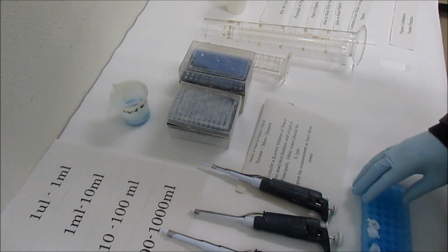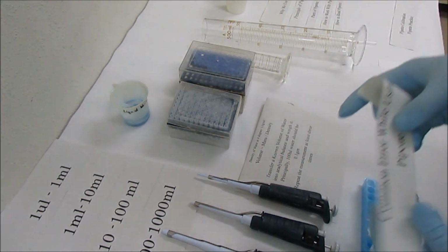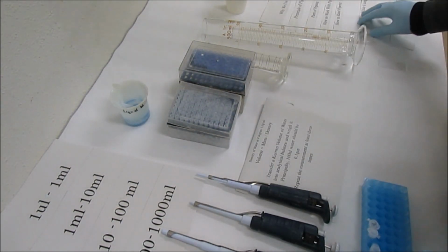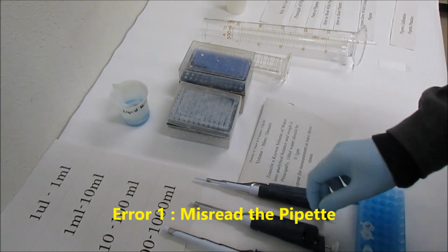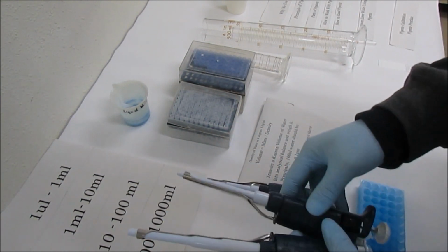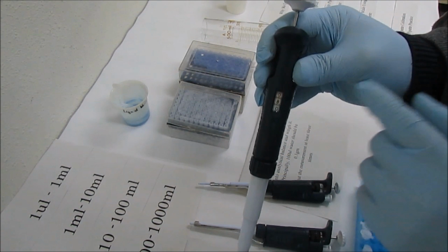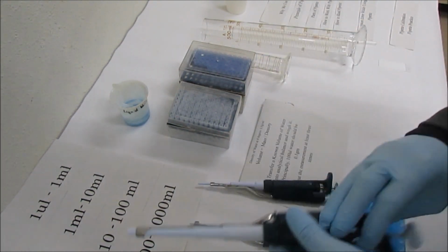Now I am going to tell you the common errors while pipetting. First is the error in reading the pipette. As I told you, sometimes we might confuse whether it starts with 1000, whether it starts with 100, or whether it starts with tens, right? So be careful, always look at the top and see the value very carefully.